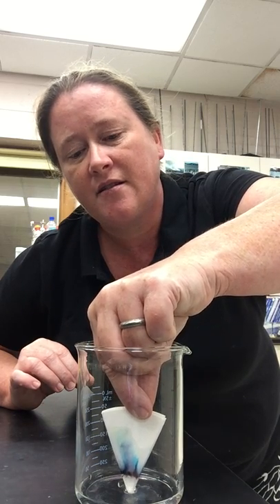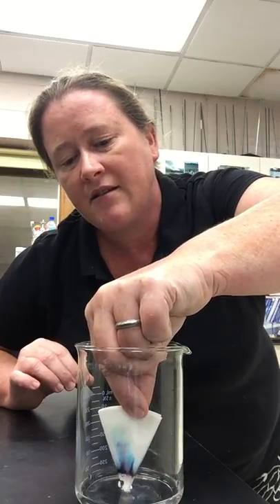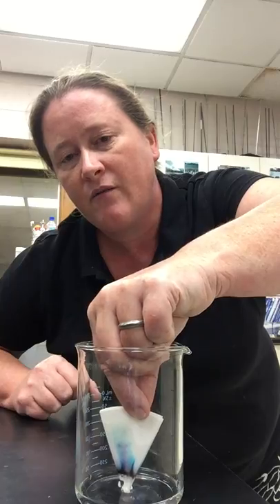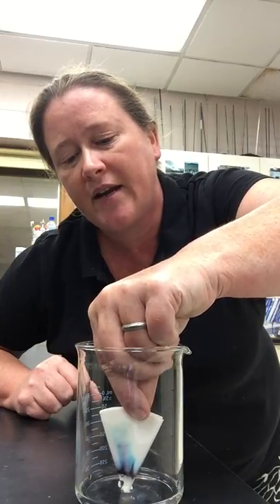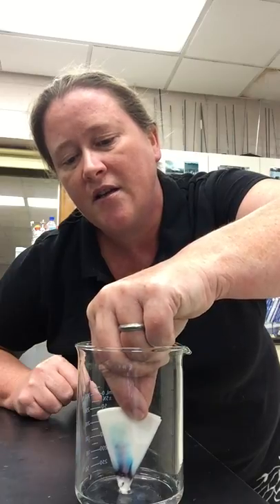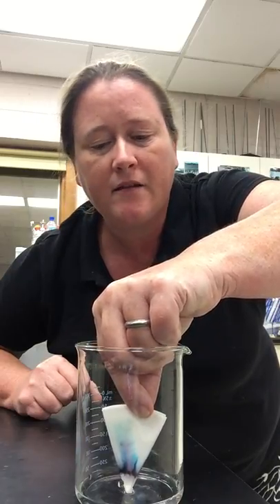As this is traveling, you can see that the blues are kind of leading the way and moving along. The water is creeping up and carrying the dyes along with it, separating out into individual colors. I'm just going to let it keep going for a little bit longer.